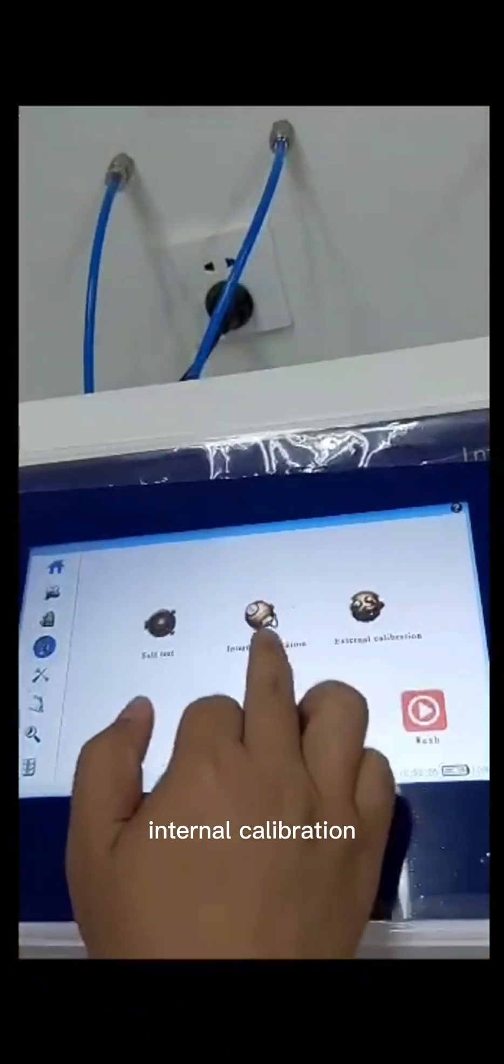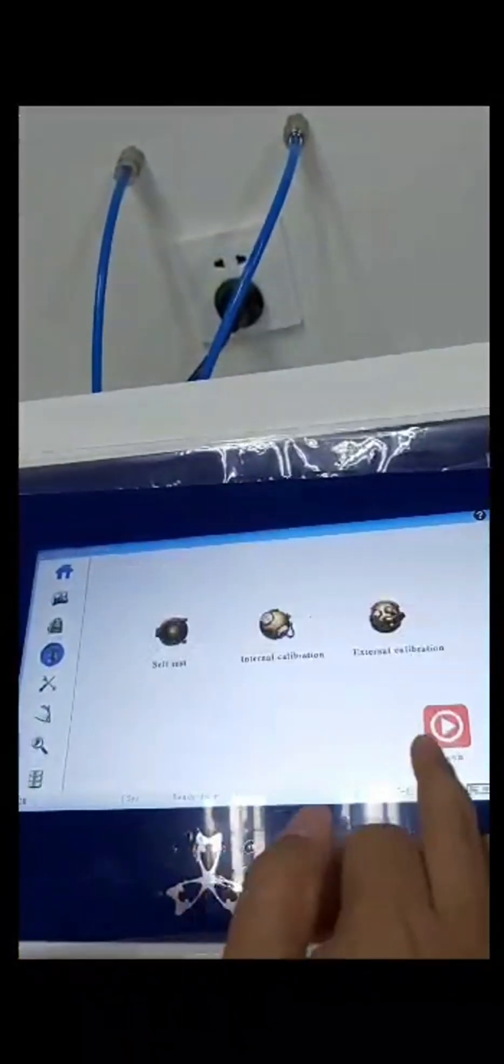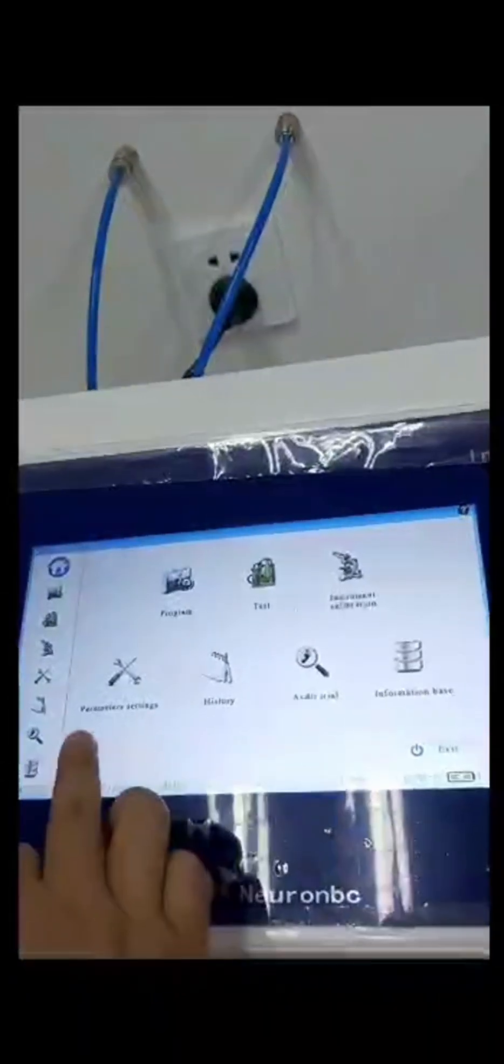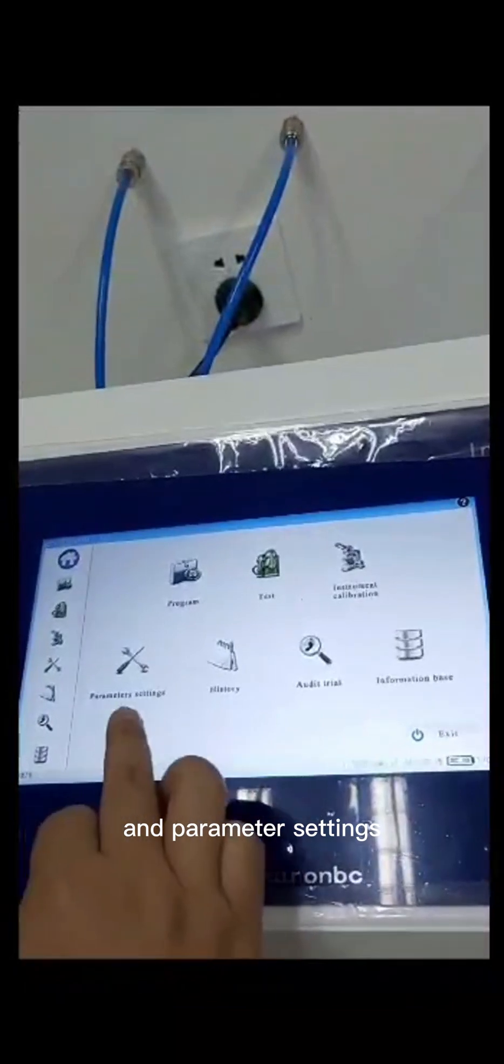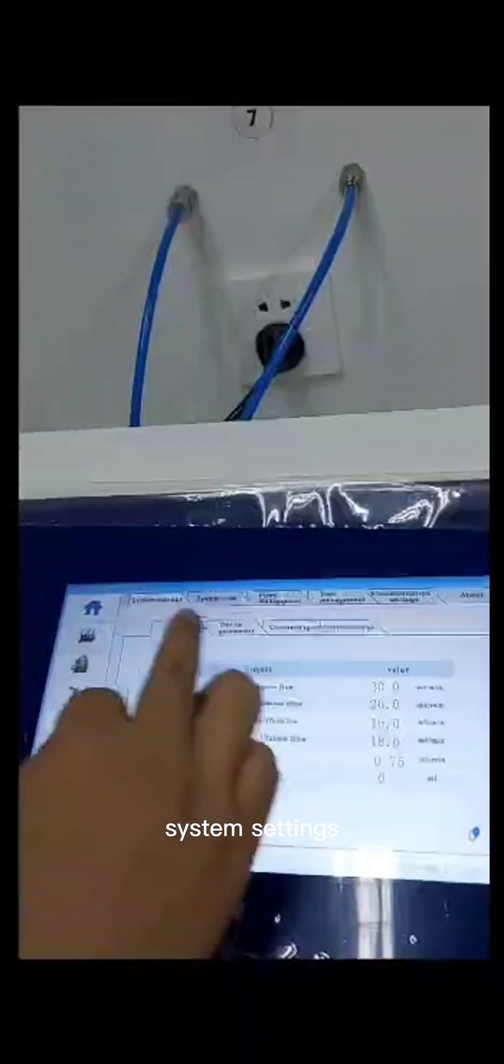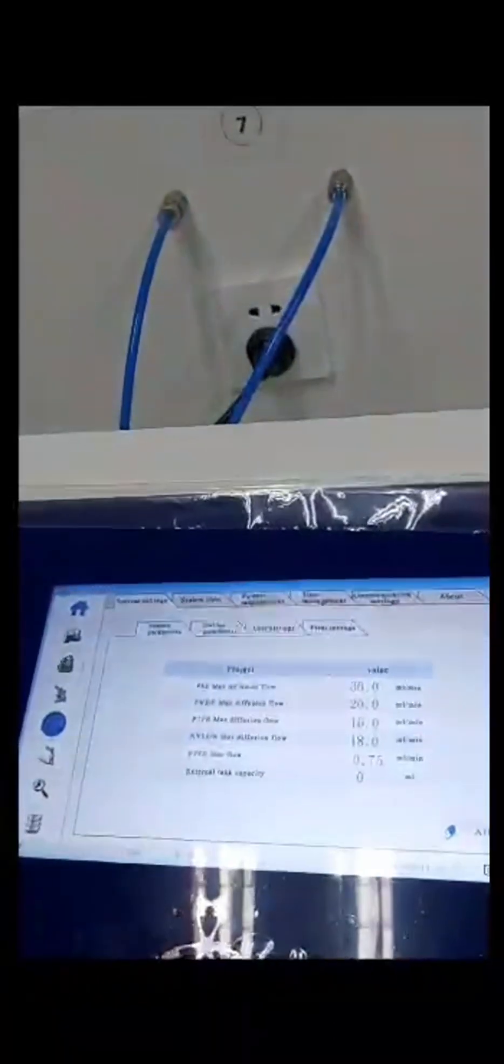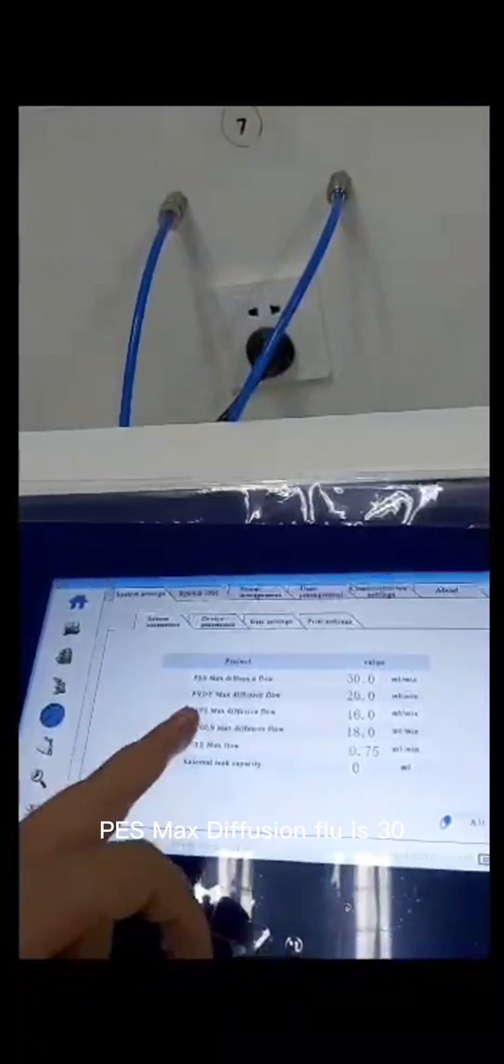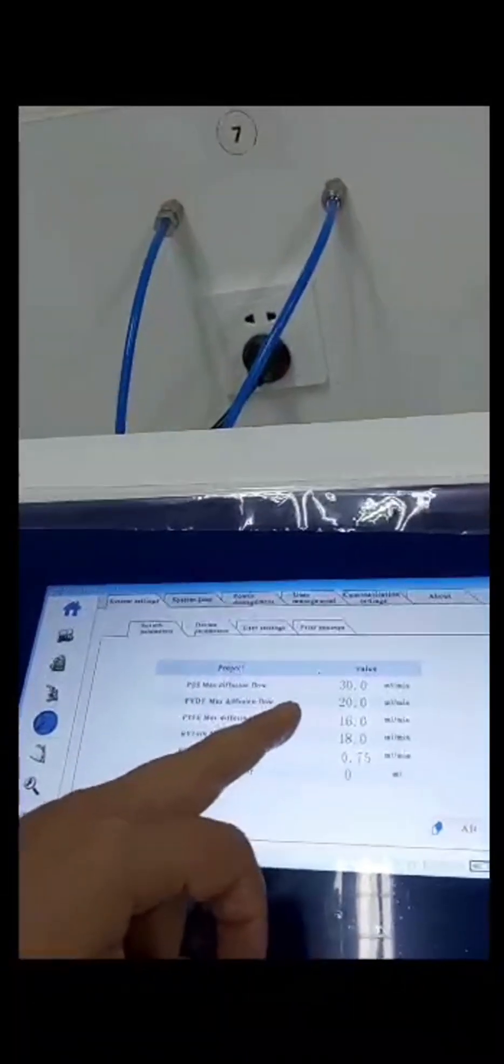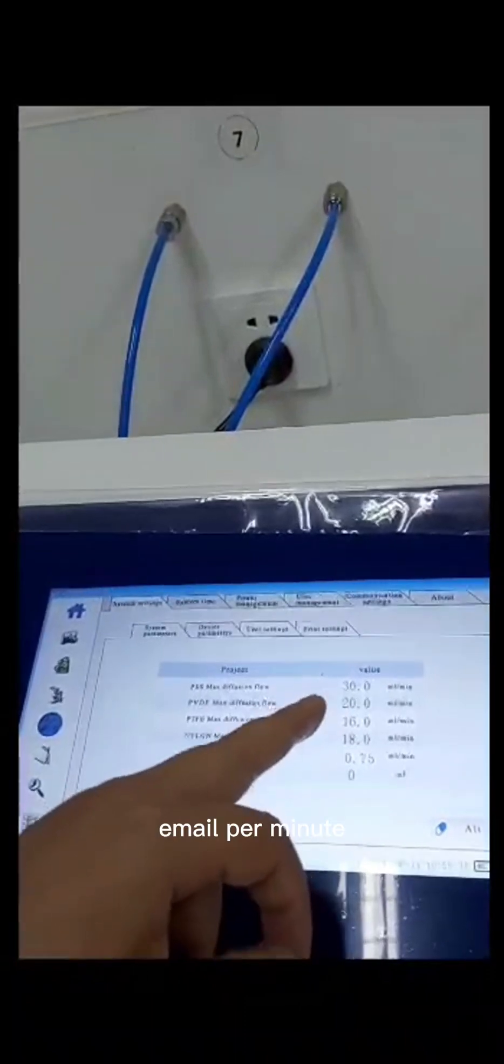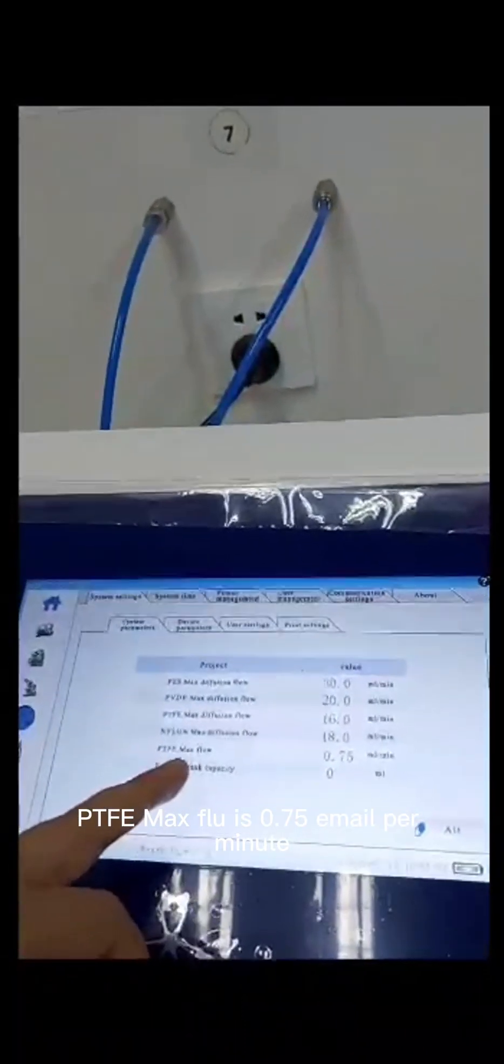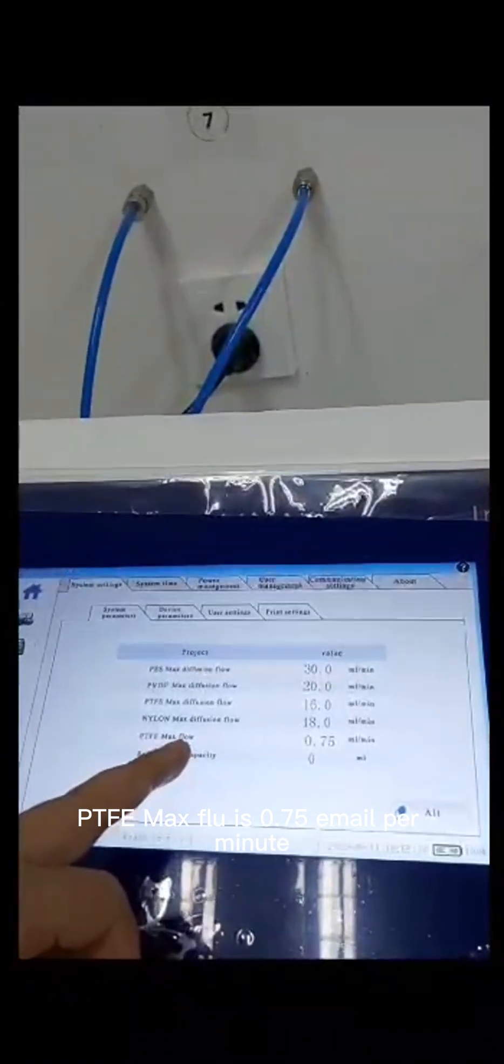And instrument calibration. Self-test, internal calibration, external calibration. And parameter settings. System settings, system parameters. PES max diffusion flow is 30 ml per minute. PTFE max flow is 0.75 ml per minute.